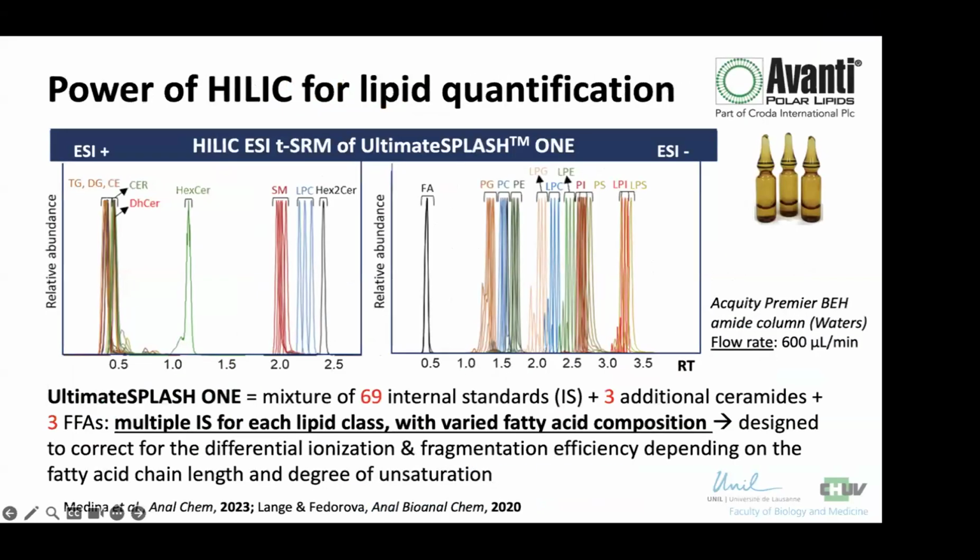So there's been a lot of effort to shorten this time down, in some cases using virtually no retention time whatsoever, and just pushing in everything all at once. And here you're using a relatively short retention time of roughly 3 minutes or so. Could you just briefly explain, because I think this is an extremely important point, why you go towards this? What are the advantages that you see in extending it out a couple of minutes in terms of per analysis versus just doing a direct injection or virtually no separation whatsoever?